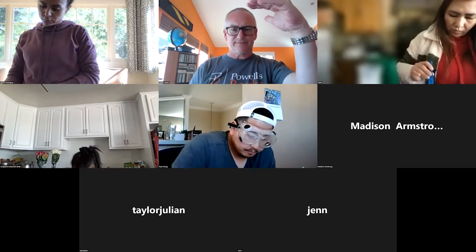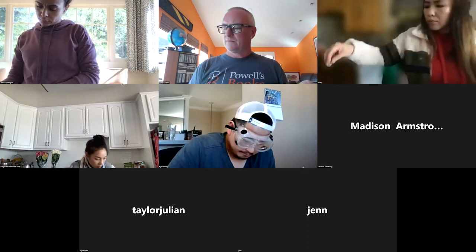I don't expect that's going to be linear. You're probably going to have some sort of curve with a maximum wherever the best pH is, which most likely will be between 6 and 8, I'm assuming. So the first two are relatively straightforward. The third one is going to take a little longer, as I mentioned.